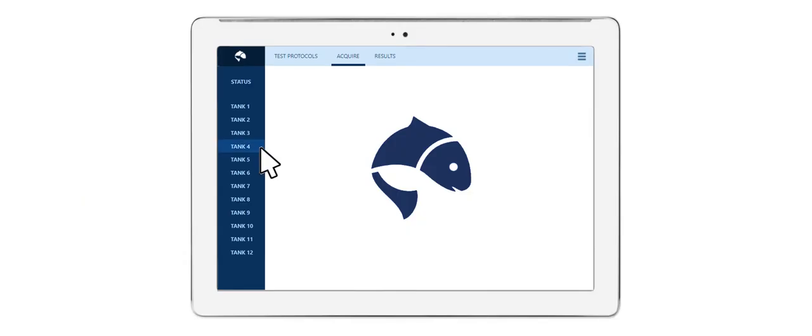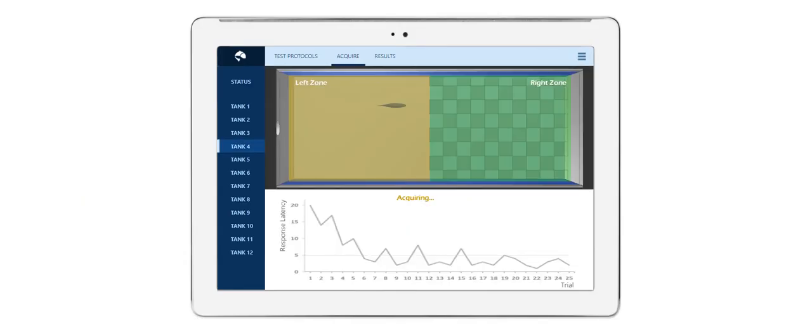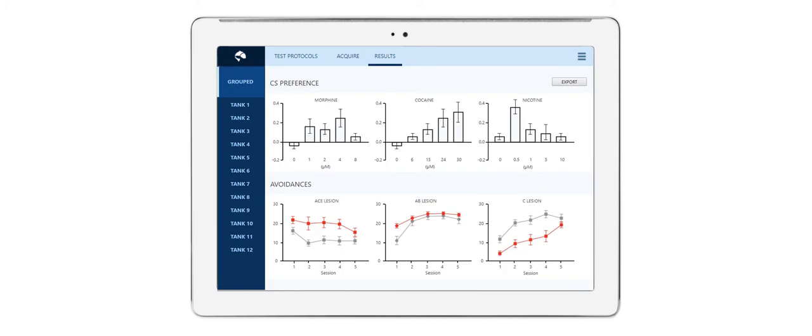In the software, you can follow the data acquisition and look at both subject and group results.